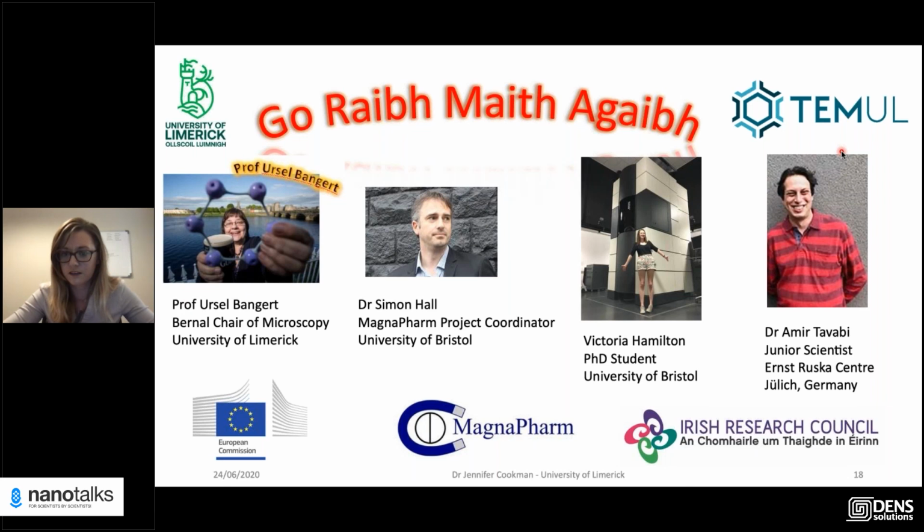Is it because they have their own van der Waals forces or electronic forces, and some of them are long range and some of them are short range? So this is what I do. I study particle interactions of the same dimensions you are looking at. That's why I put the question there, because I would like to know why this anomalous behavior. It should all crystallize. It should not be forming those chain-like structures that look like fumed silica, like necklaces.